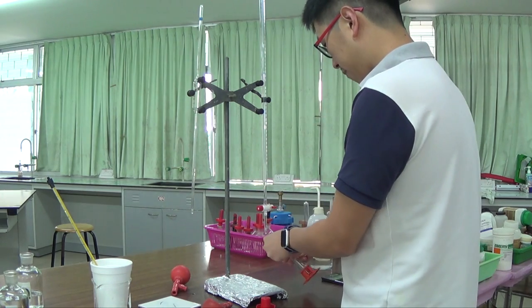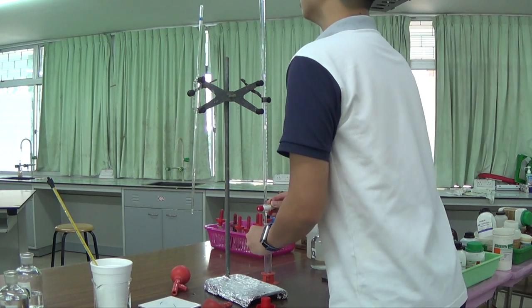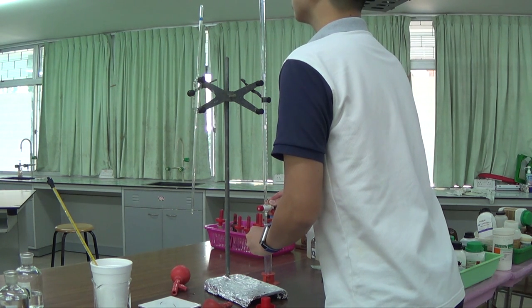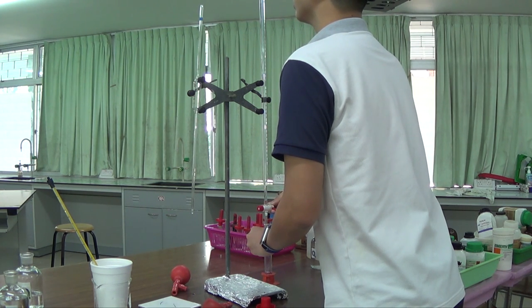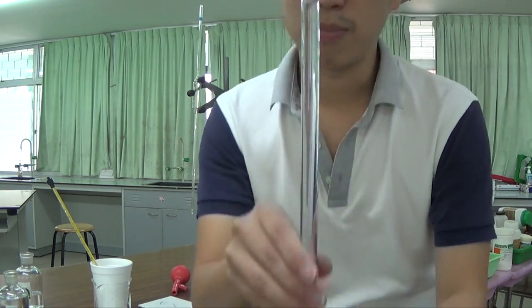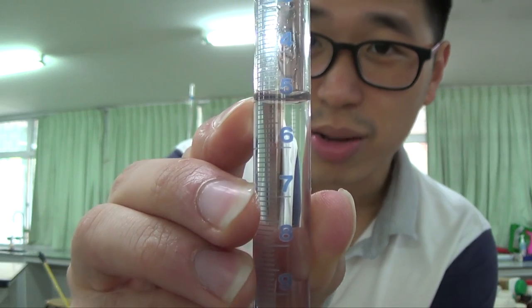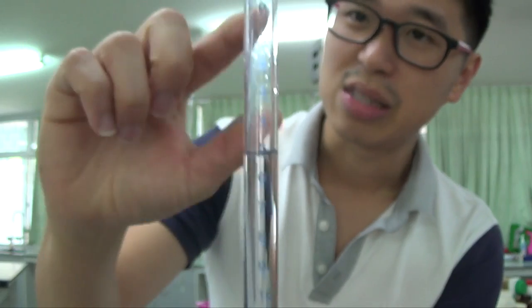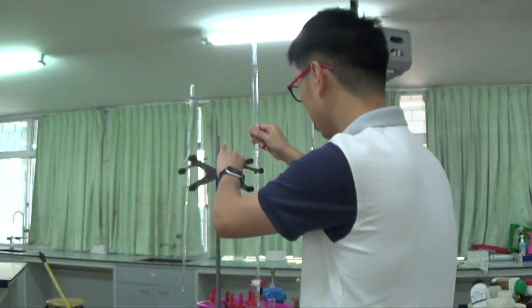Okay. So I need 5.0 cm³ on the burette, not on the measuring cylinder. Careful towards the end because you don't want to overshoot it. And now I have put in 5.0 cm³. I'm sure my hands are a bit shaky, but I don't know if you can see this or not. The thing with glass and camera is that they are not very clear, so I'm not holding this at the right level, but it was 5.00 cm³. It started from 0.00 cm³ to 5.00 cm³ into the measuring cylinder.